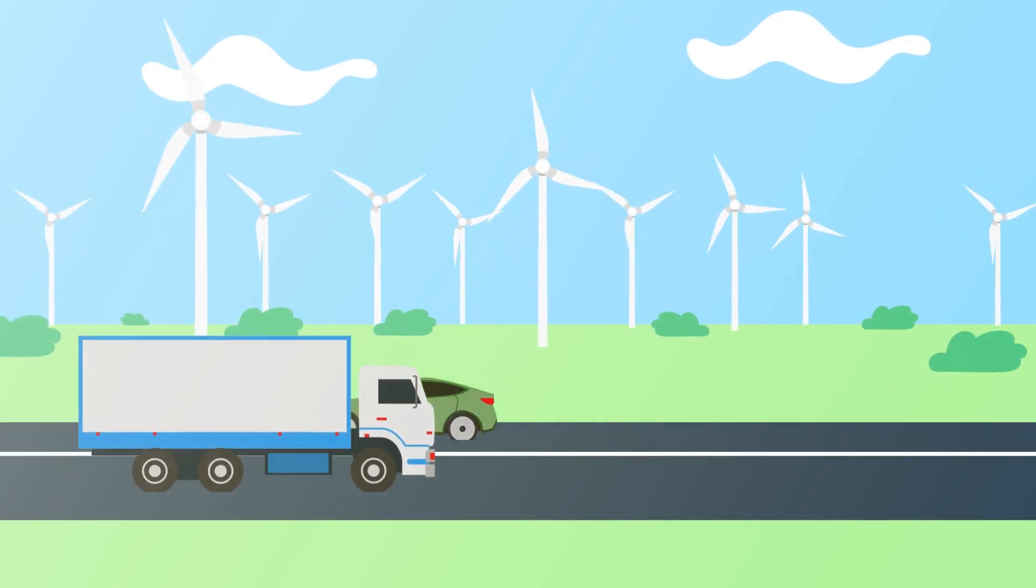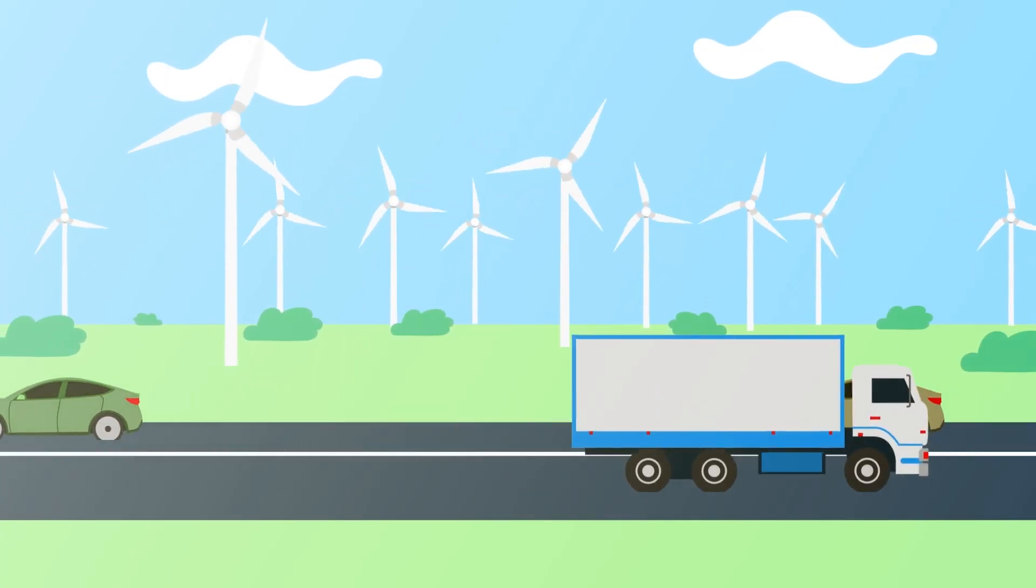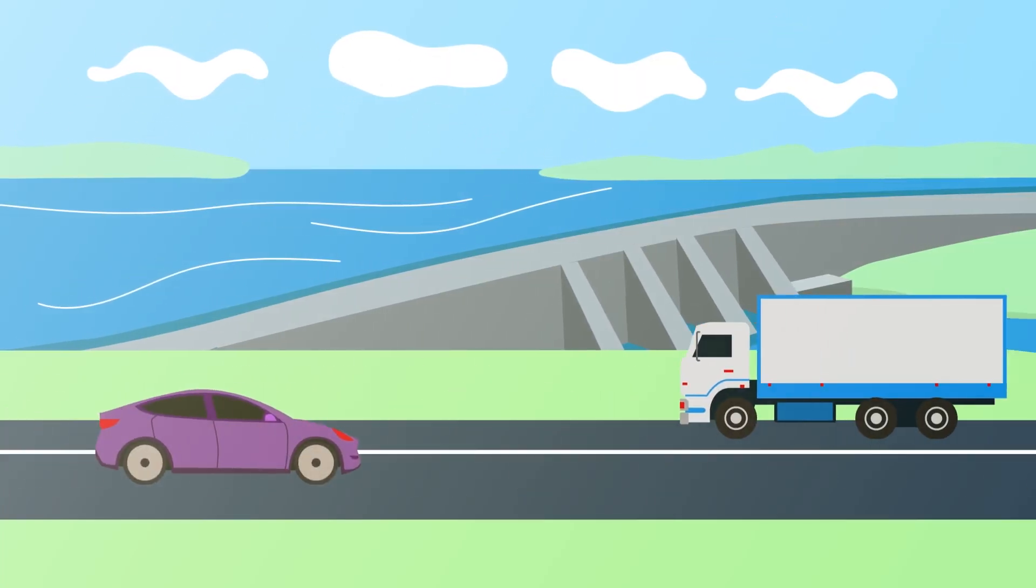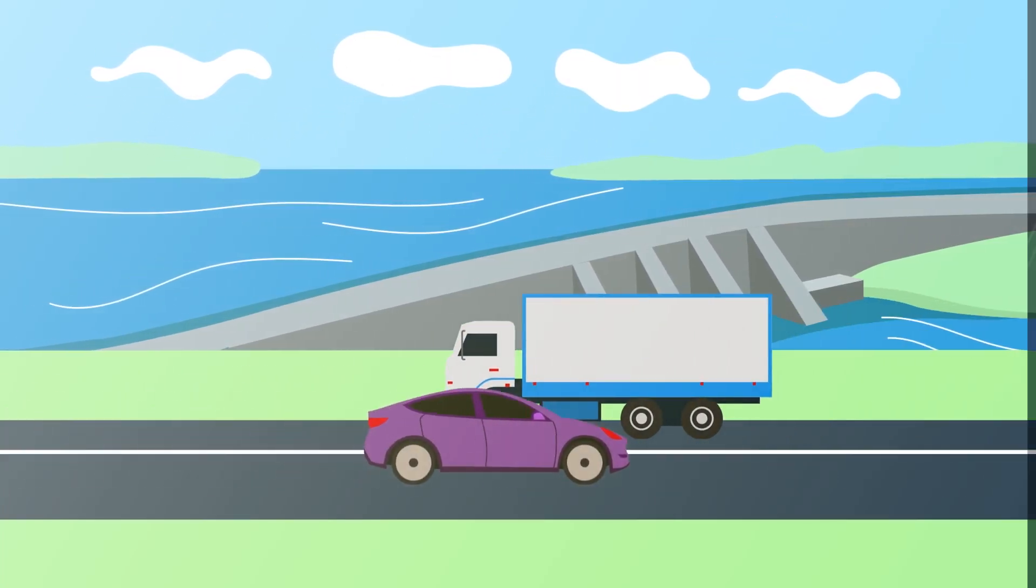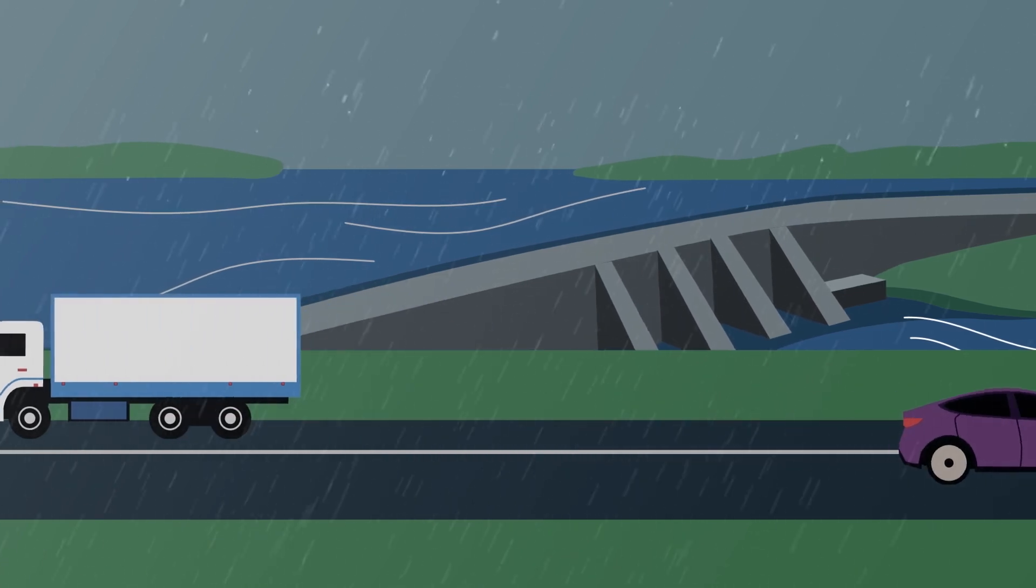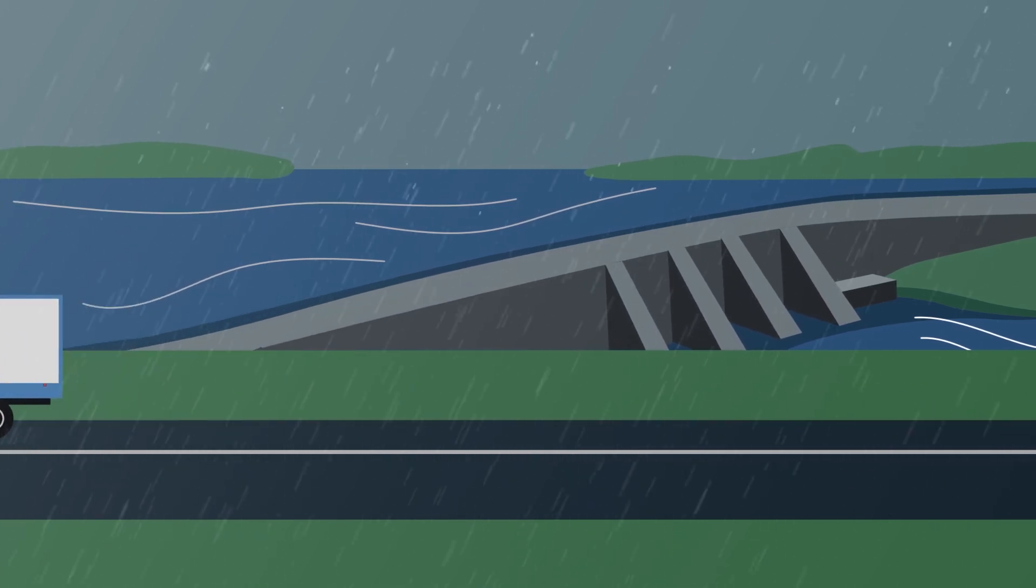In today's world, energy is generated in many ways. Safe and reliable storage of that energy has become a pivotal point of our conversation to a cleaner tomorrow.